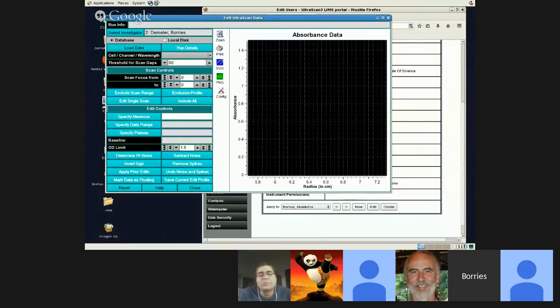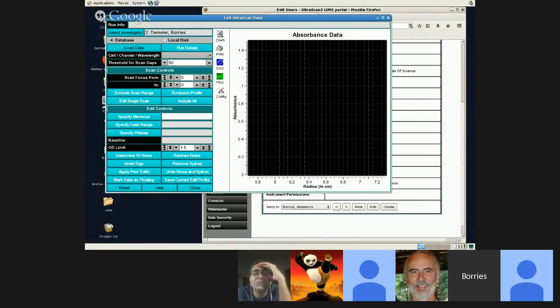Also, when we're trying to save a buffer, it gives us an error saying no MySQL rows returned, even though there is stuff already stored in the database. And then we can't save it, and you have to click OK, and nothing is saved. The same is true for analytes, and apparently also when you upload data, they don't get correctly saved. So I'm not really sure what's going on with the database, but maybe you can take a look at this and figure this out. We can also pick it up later and look at it in more detail.